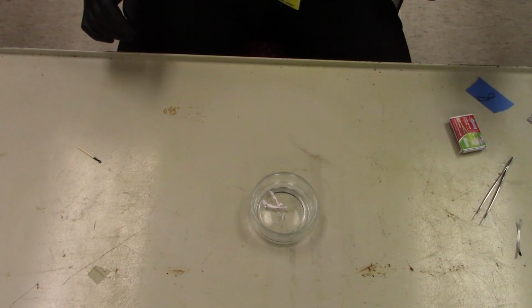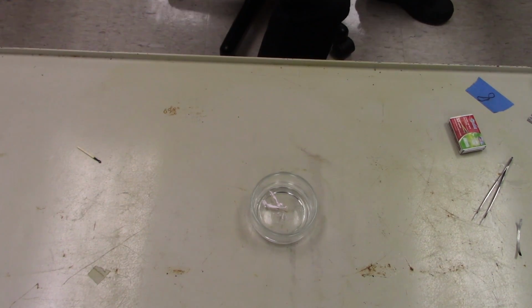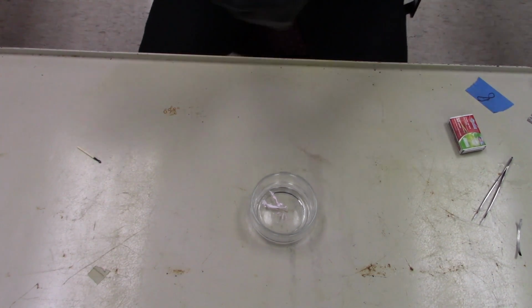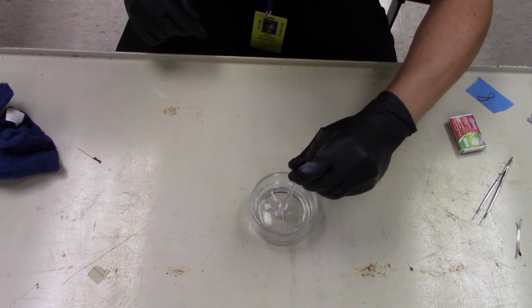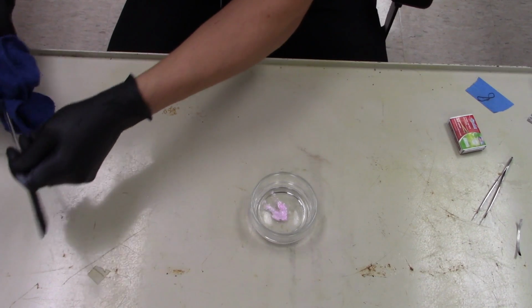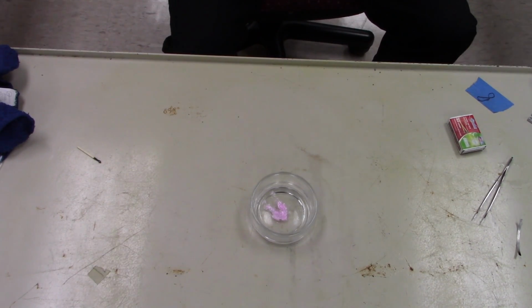And if I take magnesium oxide, where'd that thing go? Went too far. I can do kind of a test with it. So if I take it and break it up into little pieces here. So magnesium oxide is just like a white powder. But it's basic.